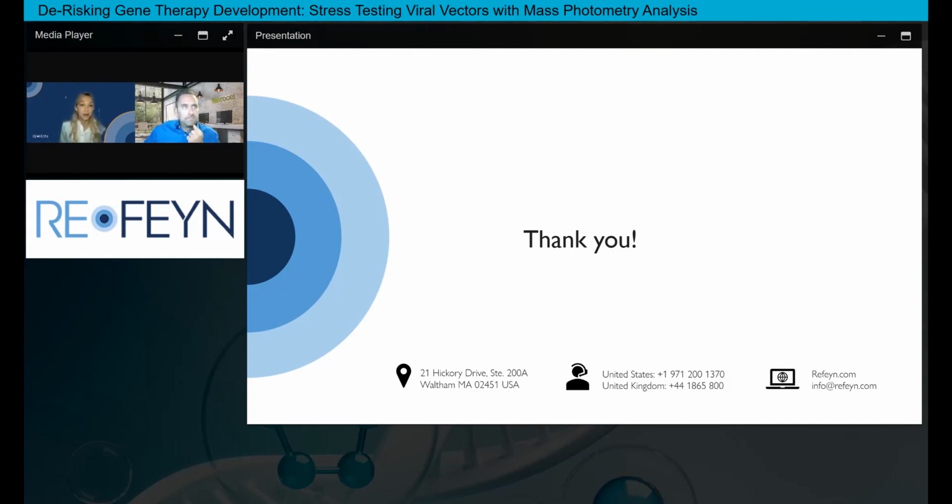Thank you for the question. So, yeah, I think macromass photometry could be very valuable. I know that we just touched on that very briefly with one example that was listed there, where lentiviral vectors were diluted into a different formulation buffer. So why is it useful? Because it's fast and relatively inexpensive, and you can see those changes by exposing viral vectors to different formulations.